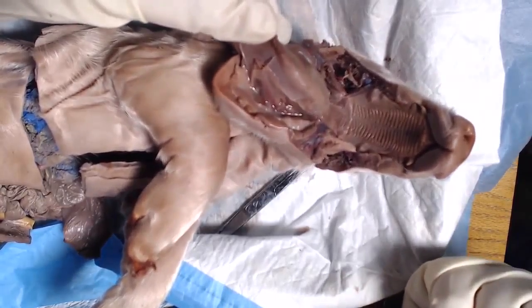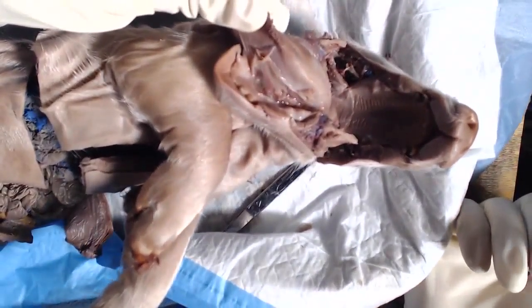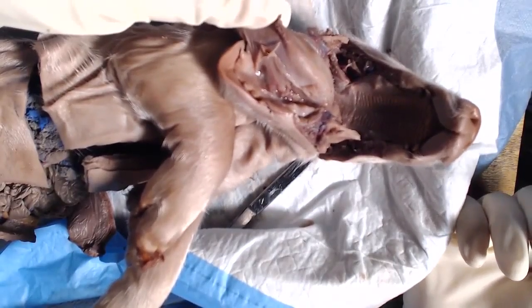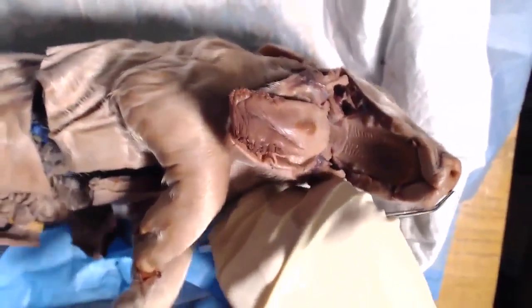All right, so at this point, we are done with our pig dissection. If you want, you can just set that to the side, and you can always come back to it later once we get through the rest of the dissection and look at any other structures you want. But I'm just going to set this pig aside for now, and we're going to turn our attention to the cow jaws.